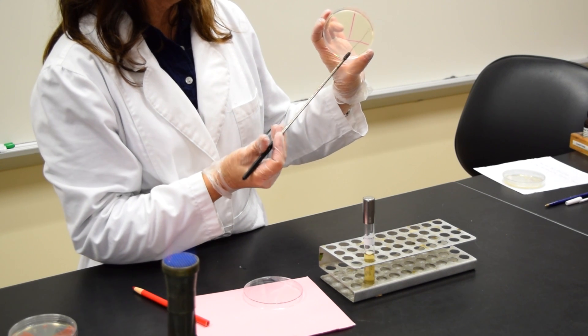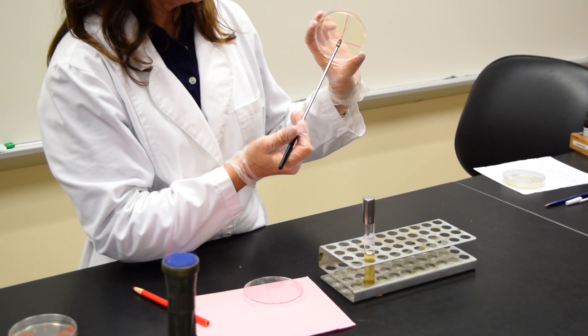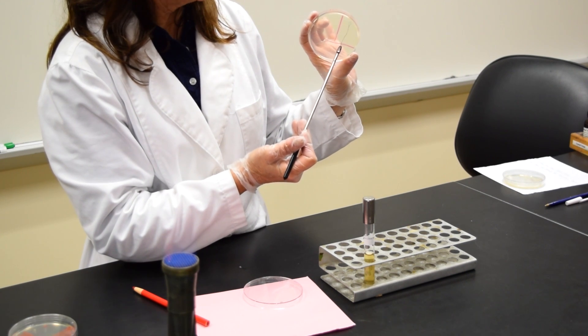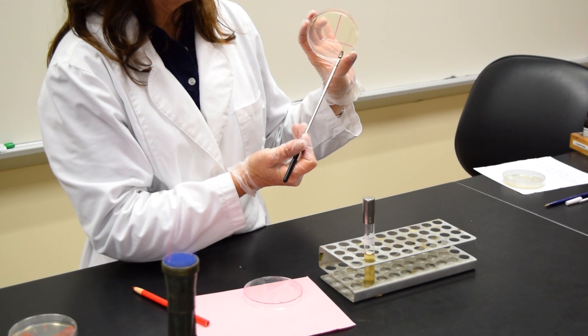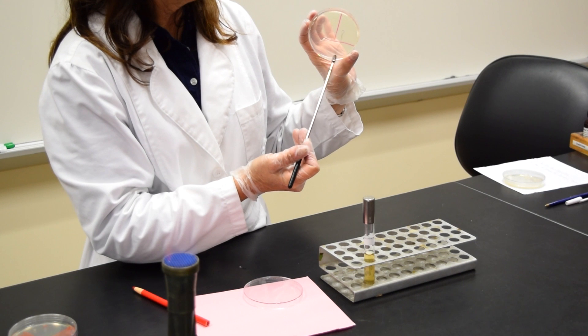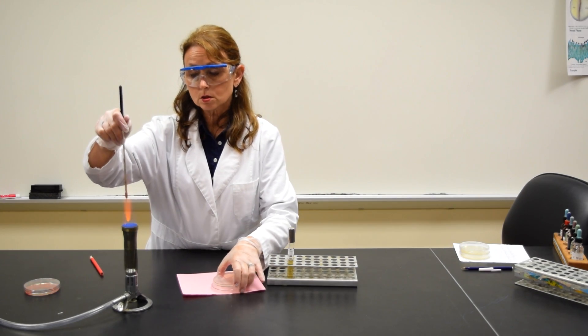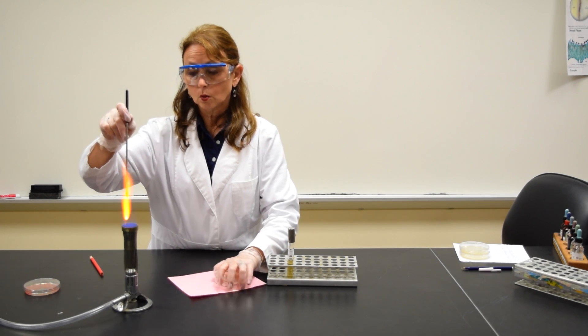I'm going to twist the plate so you can see what I'm doing. Touch the hot loop in area three to cool it. Go into the bottom of area two once, pull it out, and streak it until you get to the line. Make sure that you sterilize your loop when you're done.